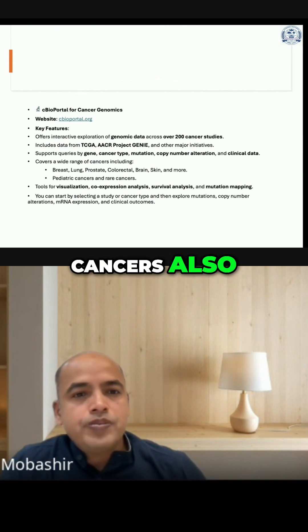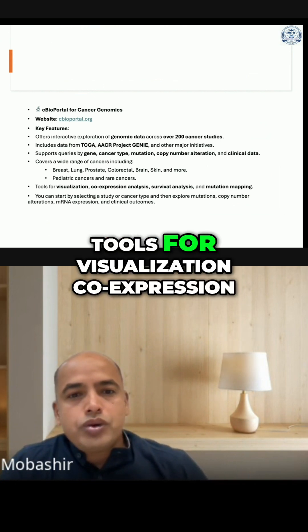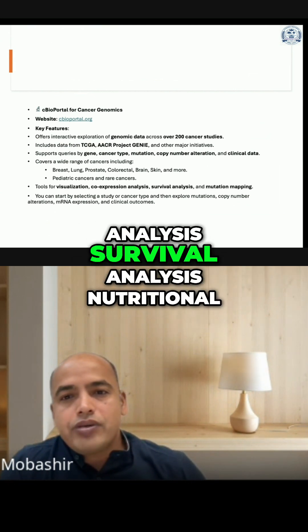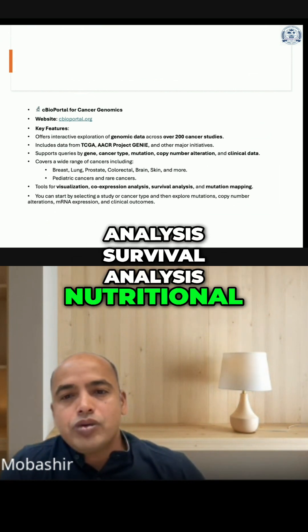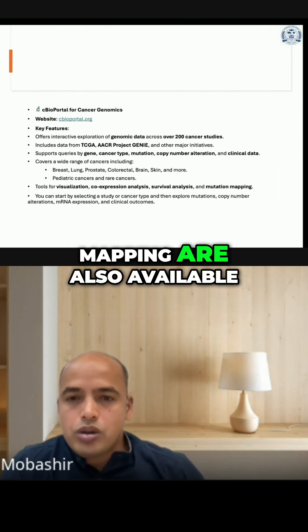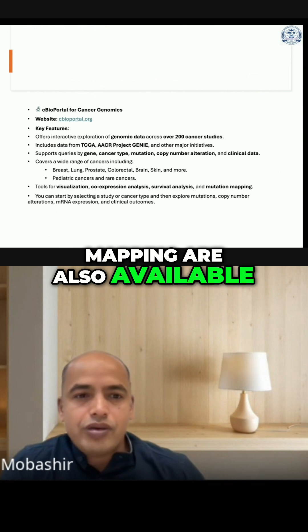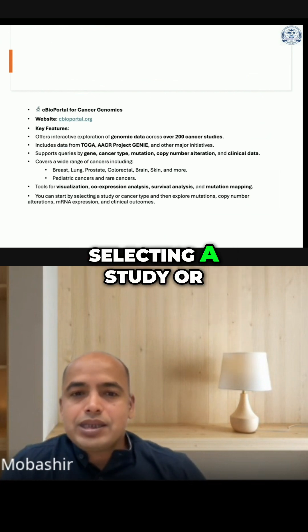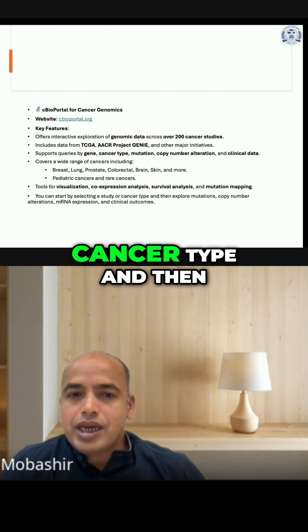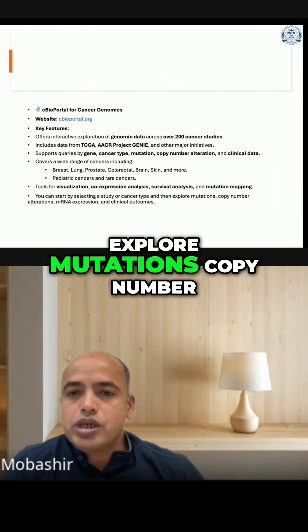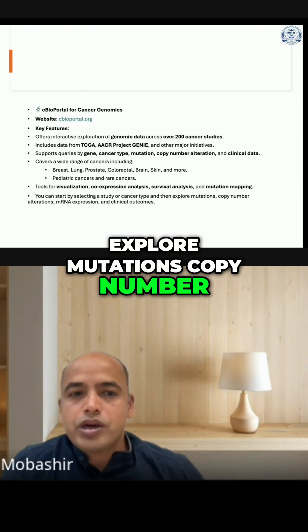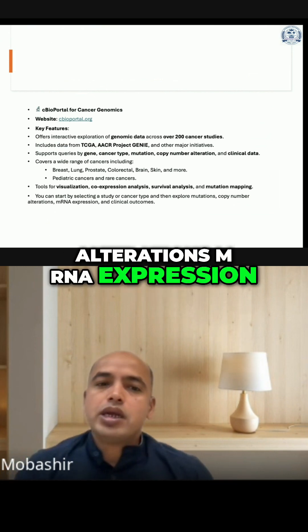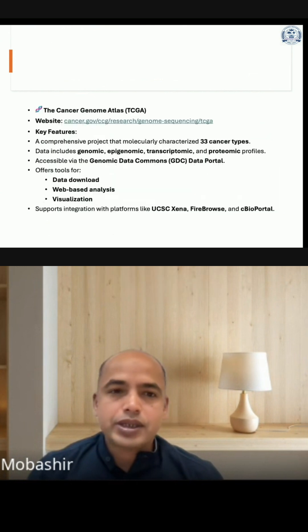Tools for visualization, co-expression analysis, survival analysis, and mutational mapping are also available. You can start by selecting a study or cancer type and then explore mutations, copy number alterations, mRNA expression, and clinical outcomes.